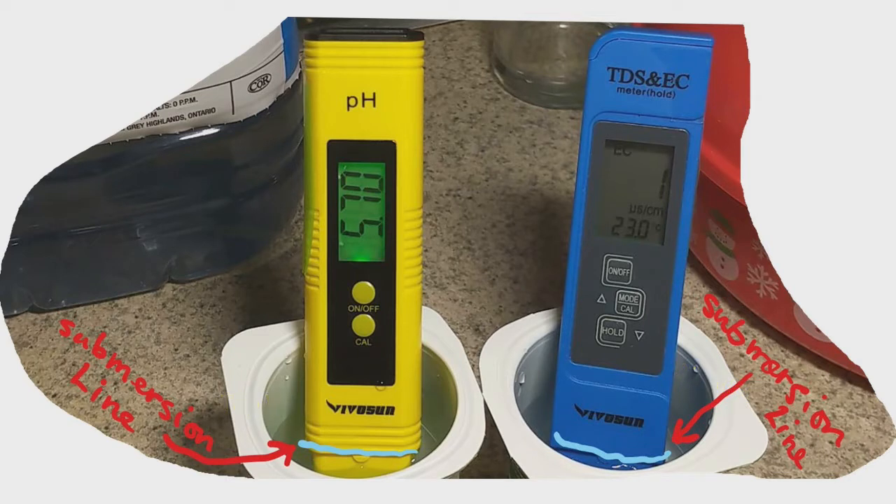One important fact I left out: you'll notice on the meters there is a submersion line. When you submerge the digital meters — and both of them have one — you're not supposed to let the liquid go above that line. It protects the digital equipment because the sensors are down below the submersion line, so just make sure you bear that in mind.